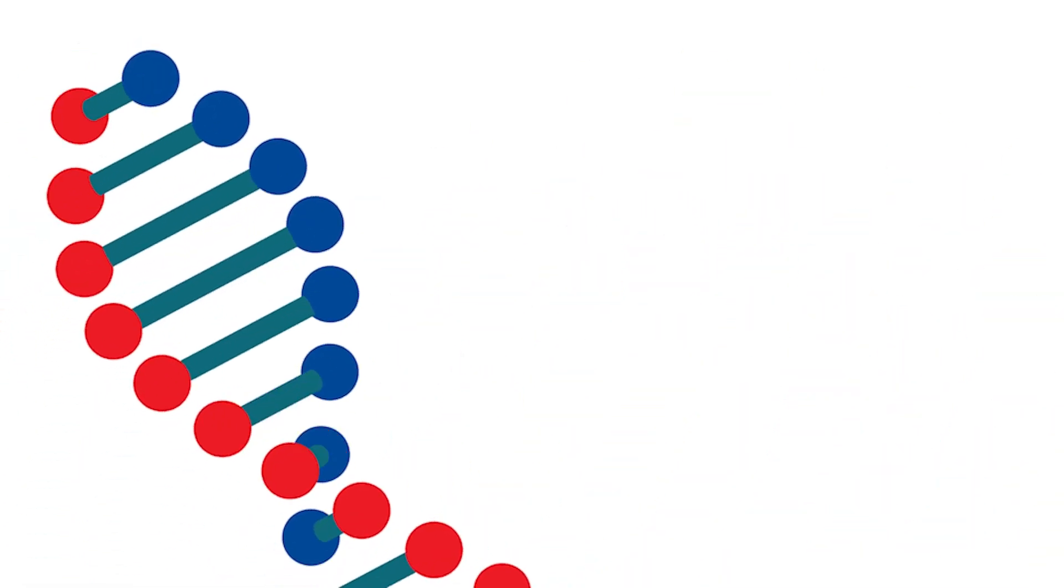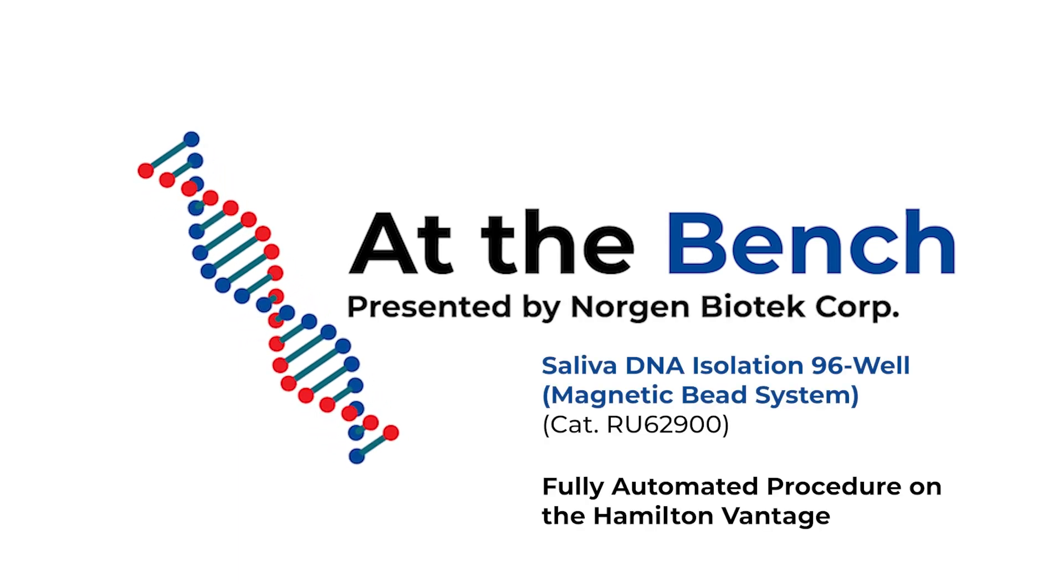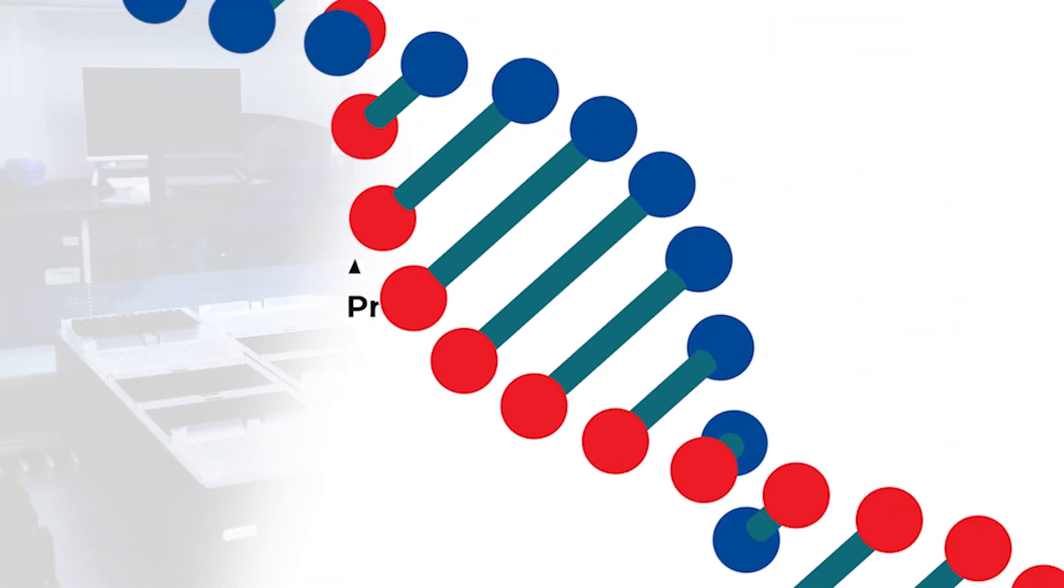Hi! You're watching At The Bench with Norgen Biotech. Today, we will be demonstrating the automated step-by-step workflow for the Saliva DNA Isolation 96-Well Magnetic Bead System Kit, catalog number RU62900.